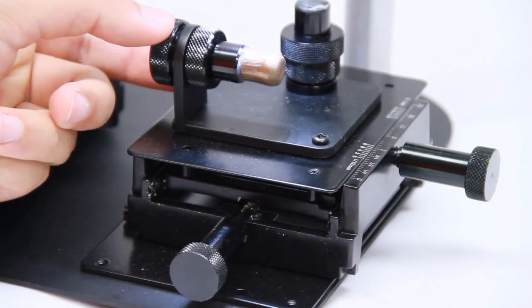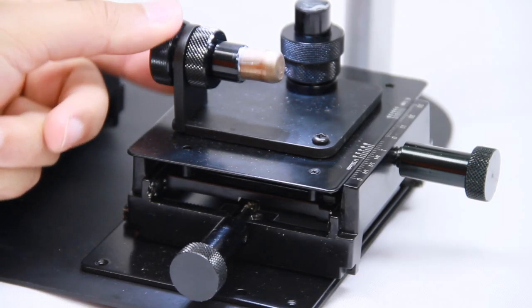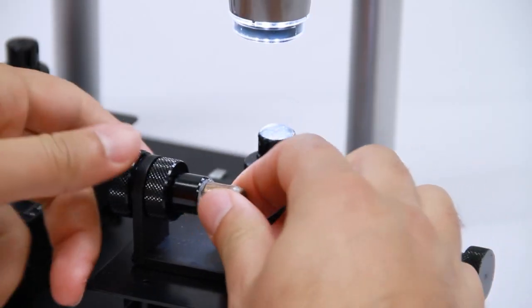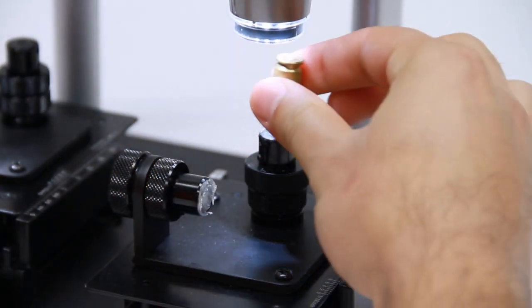Rotate the bullet with full control using the knob shown here. There's also a rear vertical rotation knob for varied comparison angles.